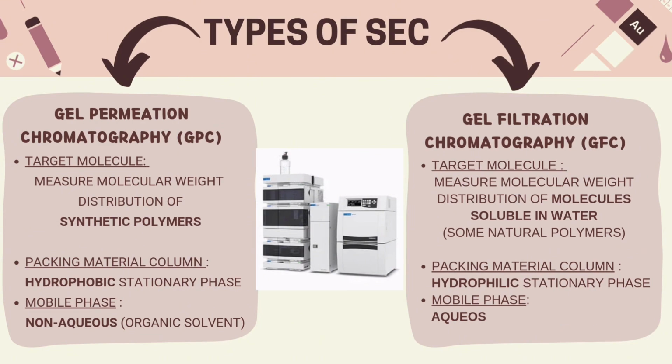Second is gel filtration chromatography. The target is to measure the molecular weight distribution of molecules soluble in water, which are some natural polymers. The packing material needs to be a hydrophilic stationary phase, and the mobile phase needs to be aqueous.